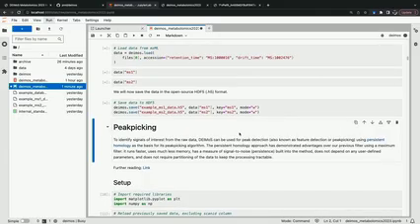Additionally, when running a Jupyter notebook, it's off a single core in your machine. There's no multi-threading with a Jupyter notebook, so processing would look a bit different in a high throughput workflow.